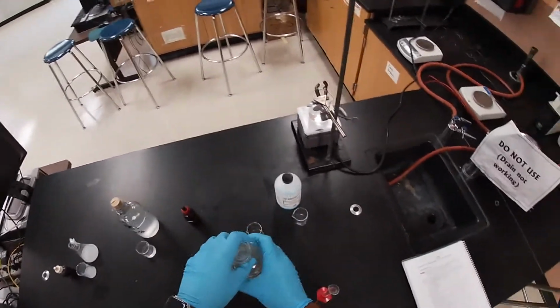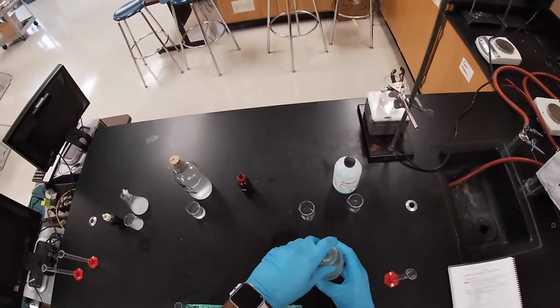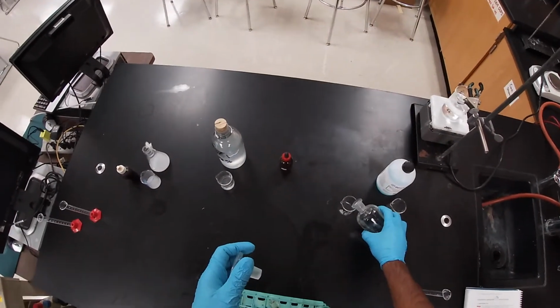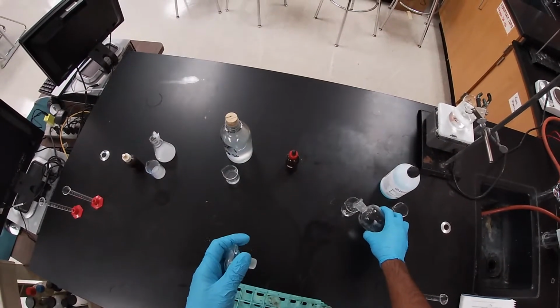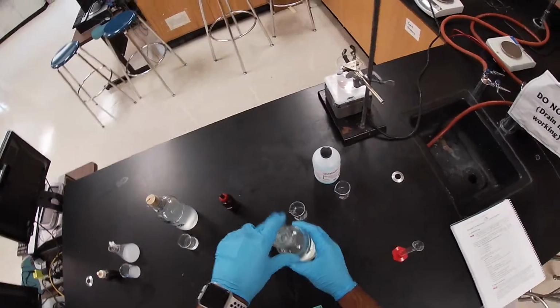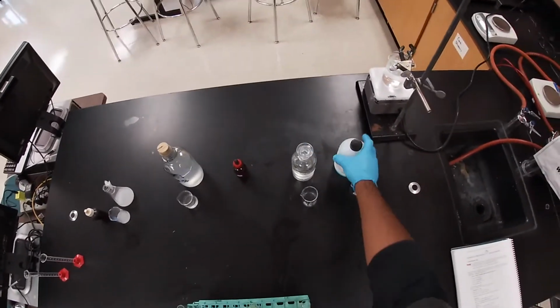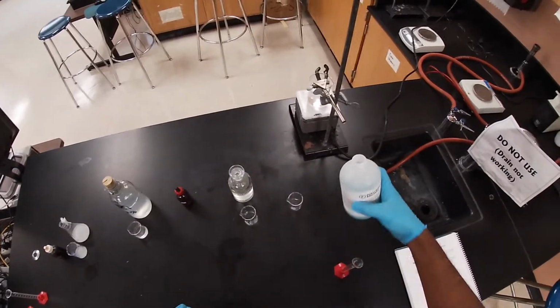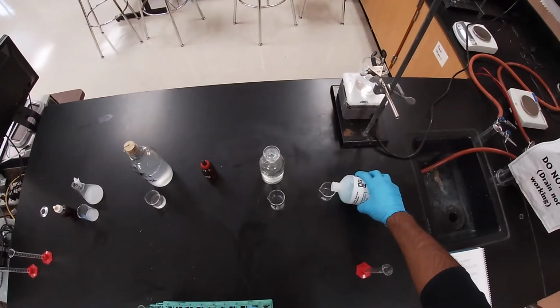And the lab has us to actually label our solutions, but I'm not going to label my solutions just because I'm the only one here, and so there's no mode of confusion, right? But normally you would label them.